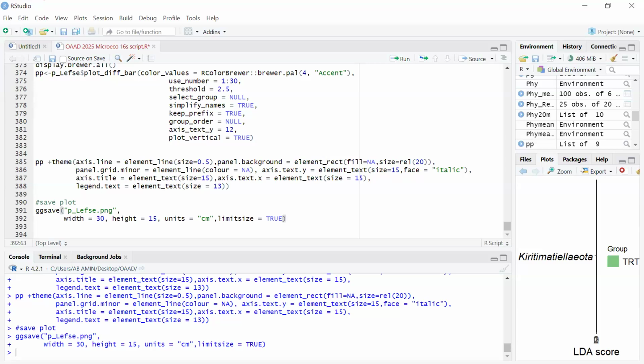So we found the new species through confirmation after genomic references. Then later we went to DDH, that is the DNA hybridization method. You have to contact some experts after you confirm with reference genes from NCBI. Then you can run the hybridization. Also you have to seek those that have previously identified new species. At that point, you can deposit your new sequence into the NCBI. Then if any other person comes, you are the first person that originated the finding of the species, and you can even name it.